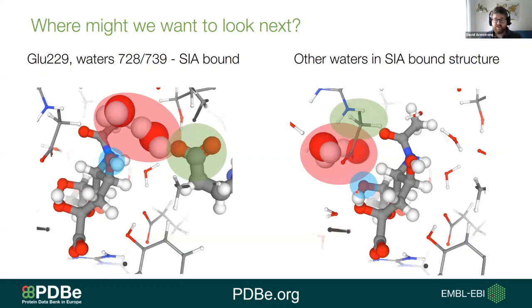So in this case, I'm looking at a slightly different hydroxyl group. In the case of the left-hand image, it's this one over the other side. And you can see, again, there's a pocket of water nearby and a couple of other functional groups available, which potentially could interact more specifically with the protein. So maybe a change to this hydroxyl to something different would enable us to get a new drug target.